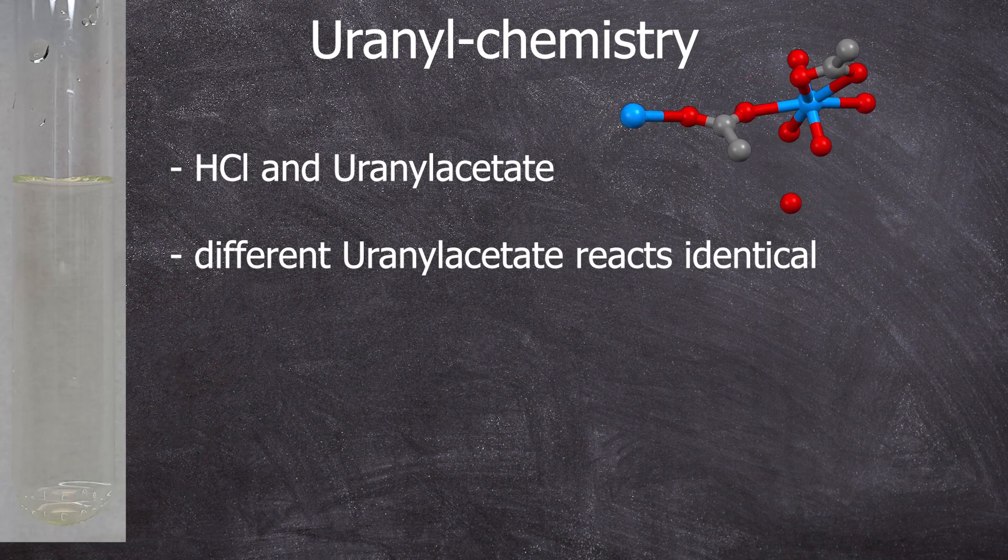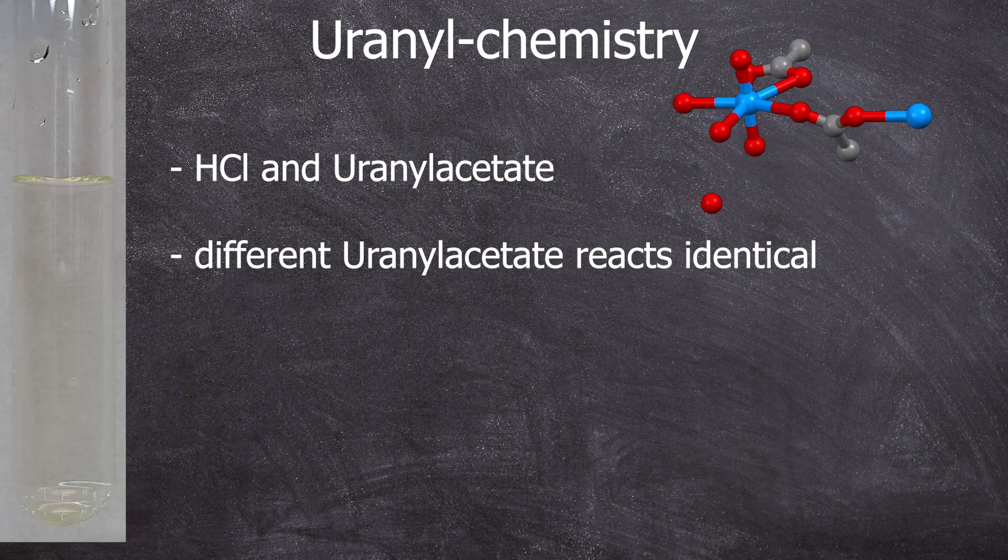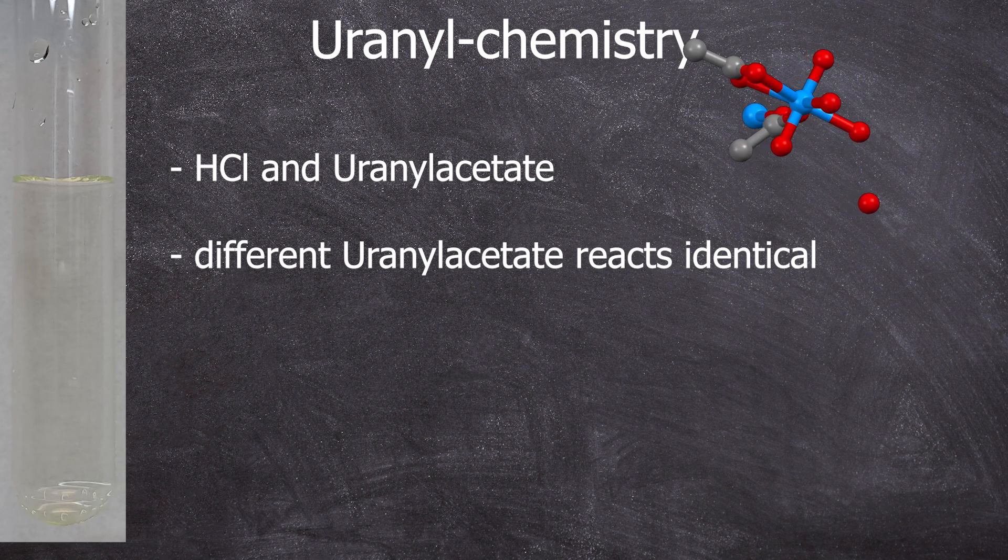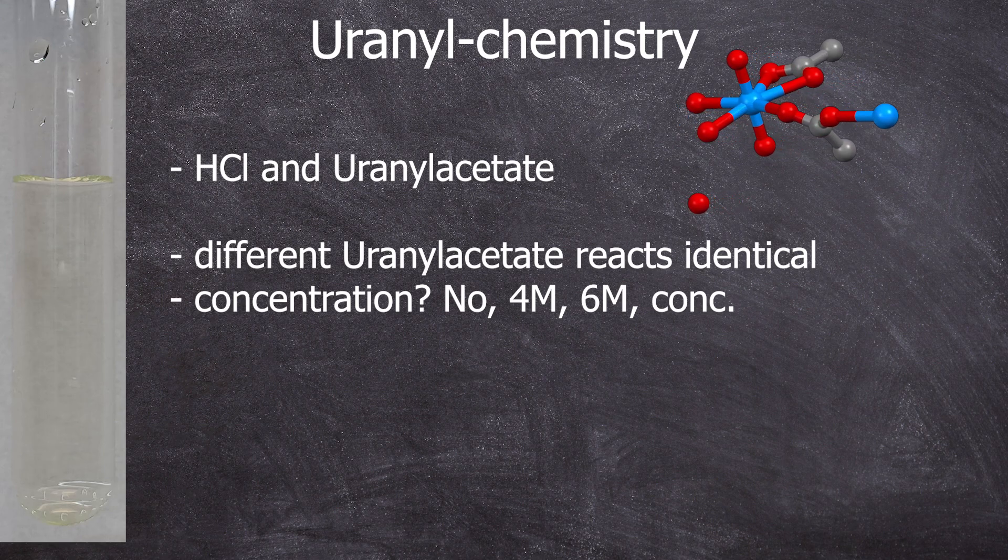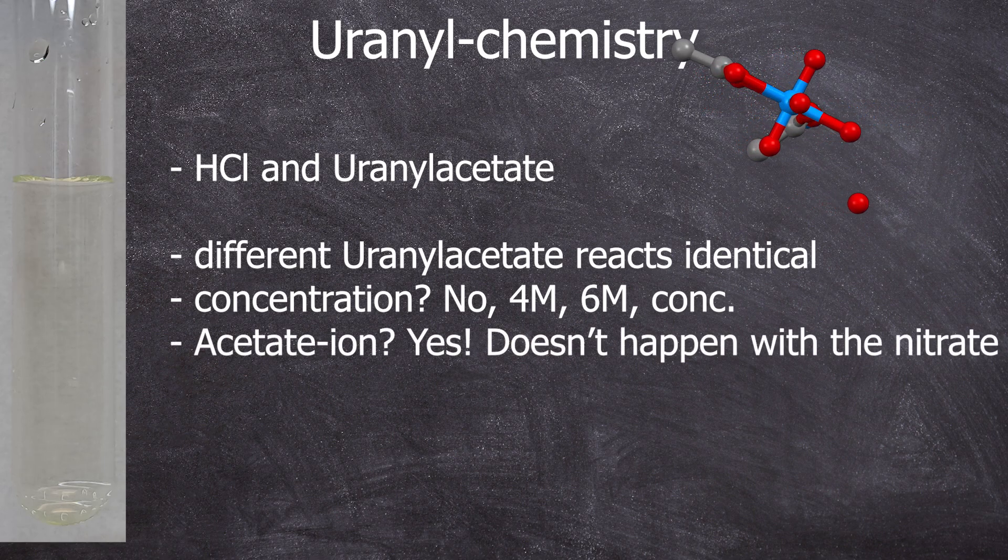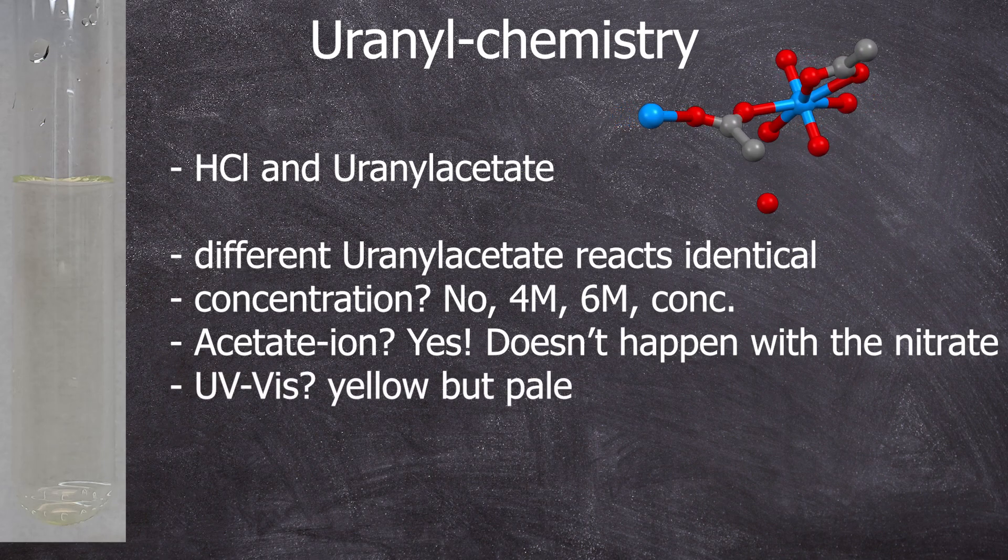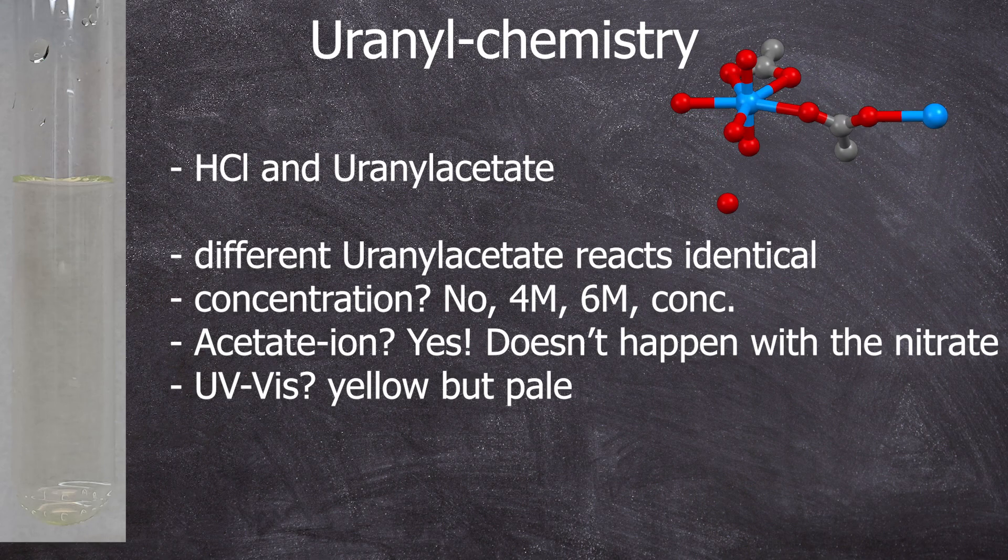I have no idea. I have been experimenting for over a week now and I still don't know much more. Was it this particular uranyl acetate? No, I used different uranyl acetate from a different container and it behaved the same way. Was it the hydrochloric acid? No, I used 4 molar, 6 molar and concentrated hydrochloric acid and they all showed the same decolorizing effect. Was it the acetate ion? Yes, it did not happen with the uranyl nitrate. I measured a UV-vis and there was no change in color. It remained yellow, but disproportionately paler than could be explained by just a normal dilution effect.